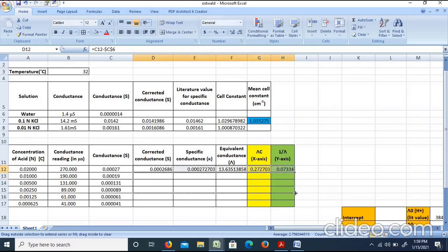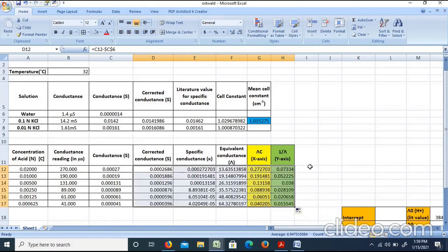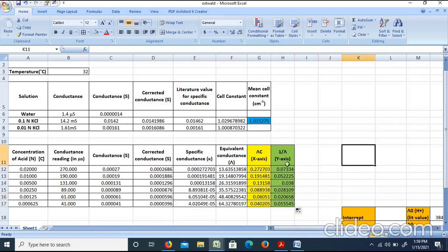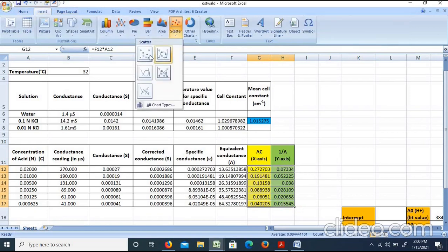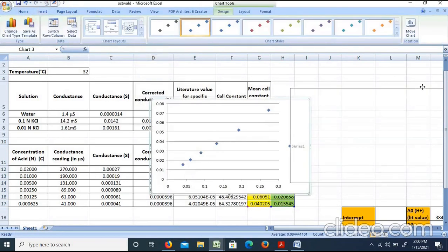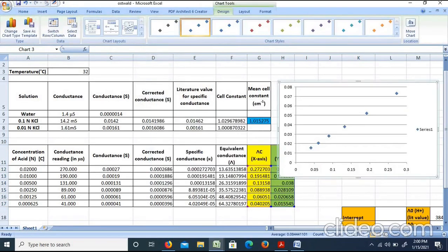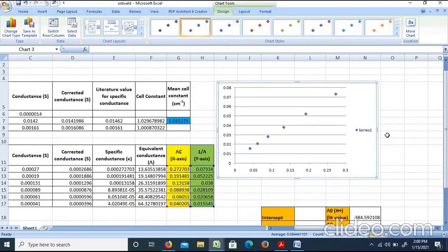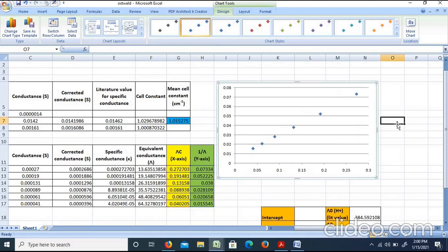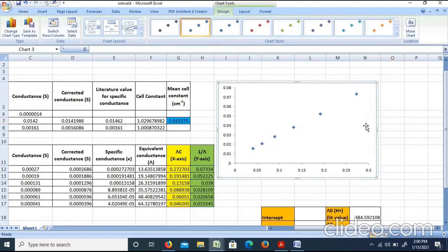We have to select the concentration values and tabulate them. To calculate and plot our values — knowing that the x-axis is lambda·C and the y-axis is 1/lambda — we select those two columns and insert them into a scatter plot. We can select the series and add grid lines to the chart.